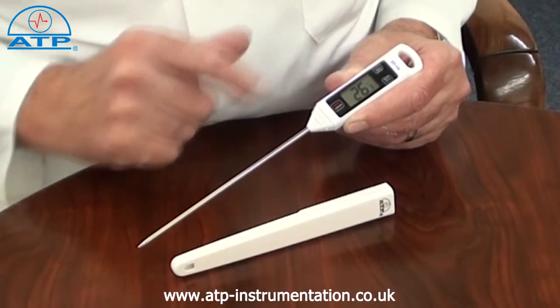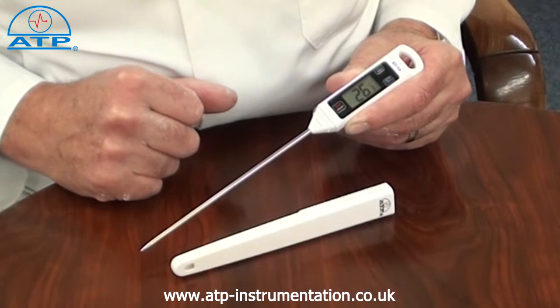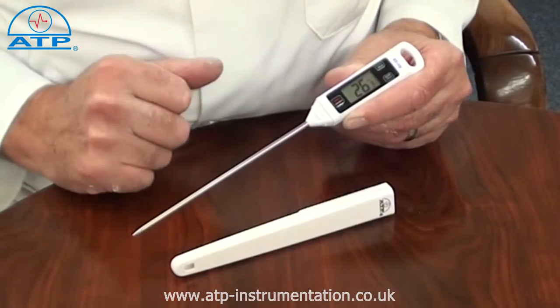The display and keypad has a sealed splash-proof membrane with three function buttons: on/off, degrees C or degrees F, and data hold.